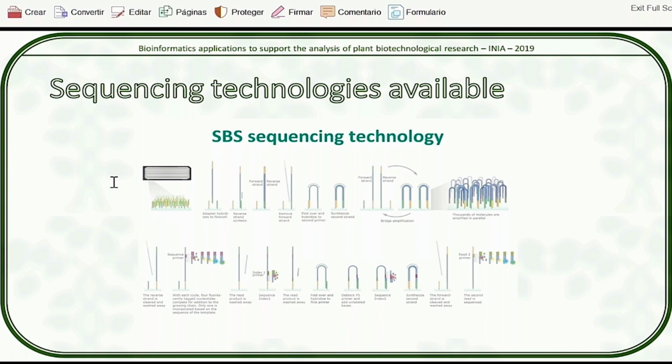There is a lot of error to go around. You can mix up the colors from bits that are very close to each other, or the colors that are close to each other may just camouflage each other. The machine can just make the error and not understand the coordinates where it's reading the light correctly, and you start reading from one coordinate and the other coordinate at the same time, which can also be tricky. So each of those possible errors is going to be taken into account when guessing back the sequence.